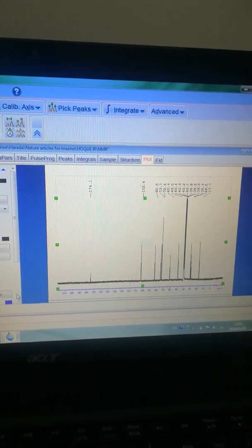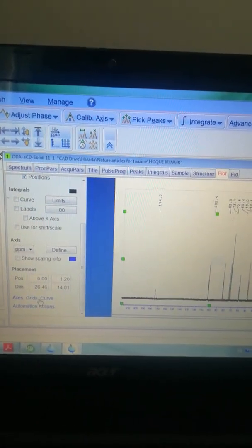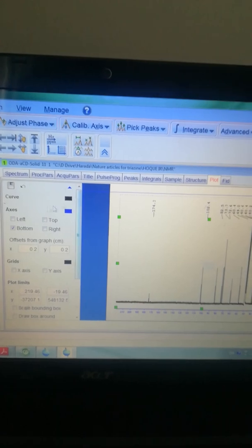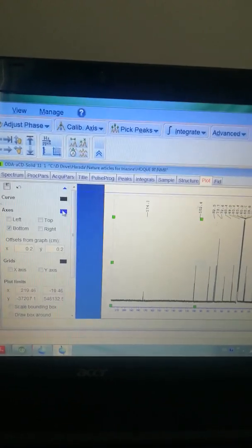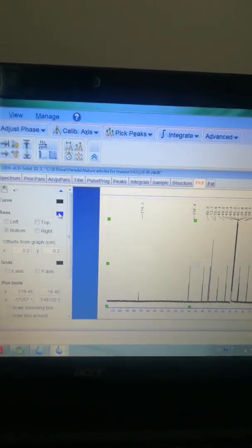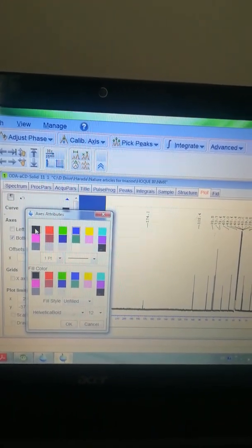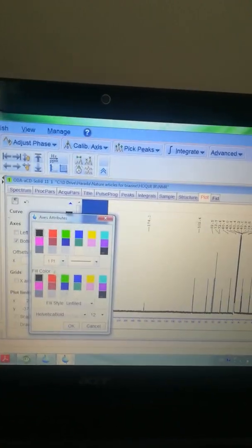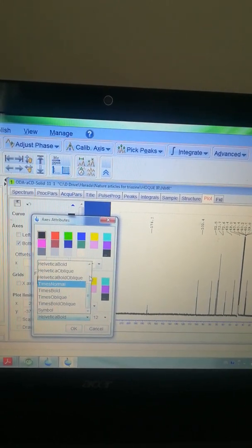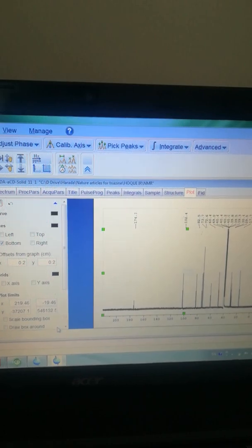I'd like to increase the font of the scale as well. Go to Axis, Grid, Curve and click here. Under Axis you can get some options. The blue mark represents the scale. Select it, change the color to black for uniform color, and change the font to Courier Bold 16, the same as the peak picking. Now it's created and the carbon-13 NMR is well resolved.